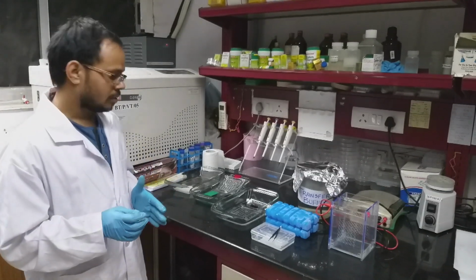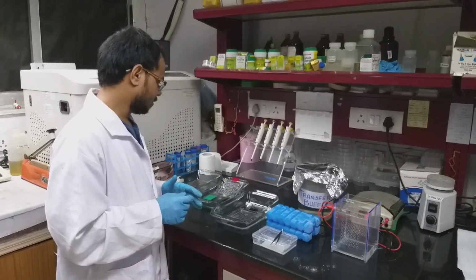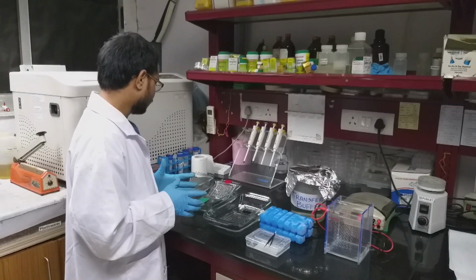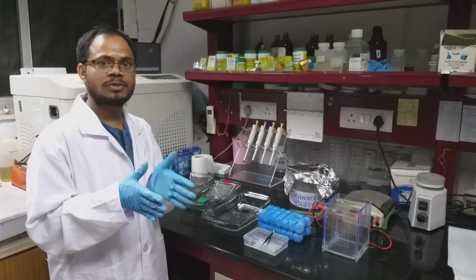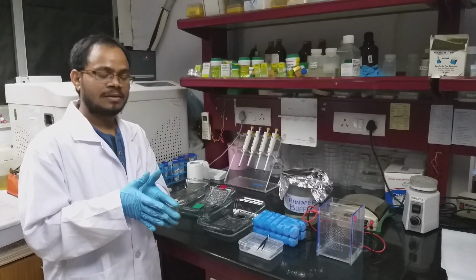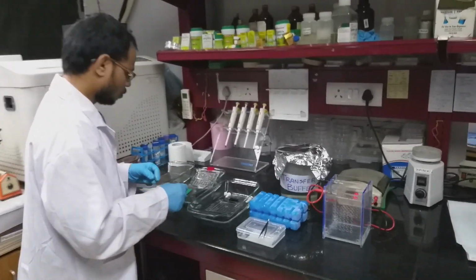So we need a pre-run gel. We have already finished the gel running. In addition to that, we also need sponges, which will give cushion to the gel so that the gel is not destroyed during the transfer.